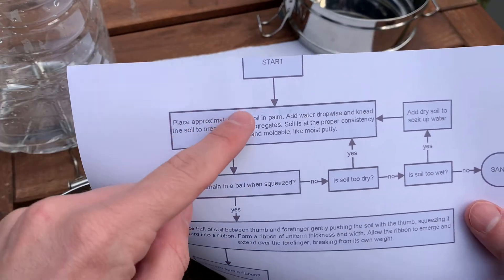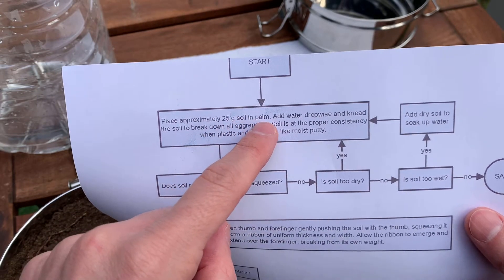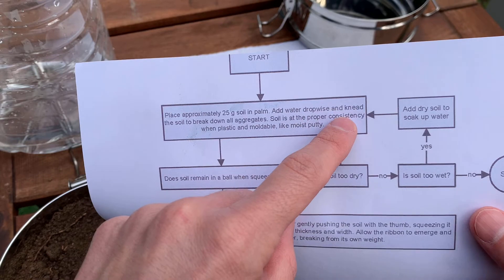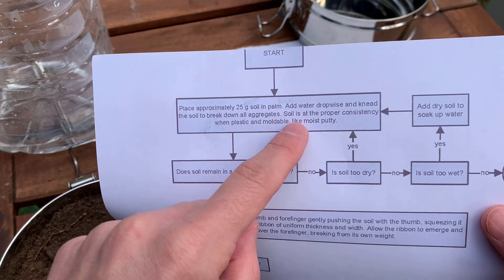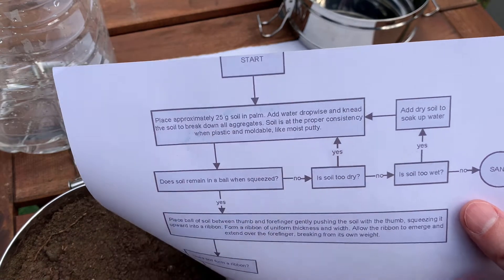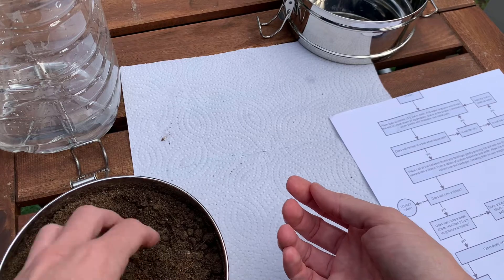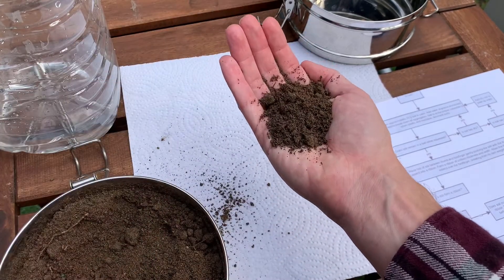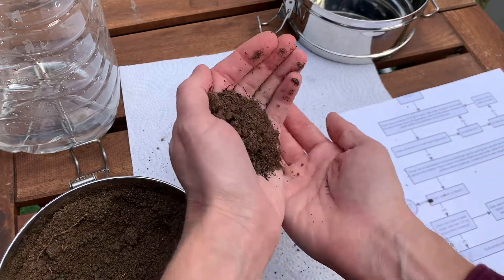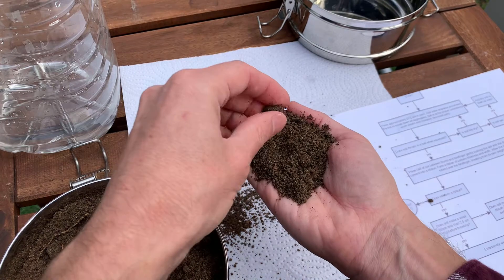The first step: place approximately 25 grams of soil in your palm, add water drop by drop, and knead the soil to break down all aggregates. The soil is at the proper consistency when it's plastic and moldable, like moist putty. For 25 grams, just fill up your palm into a little cup — that's about right.